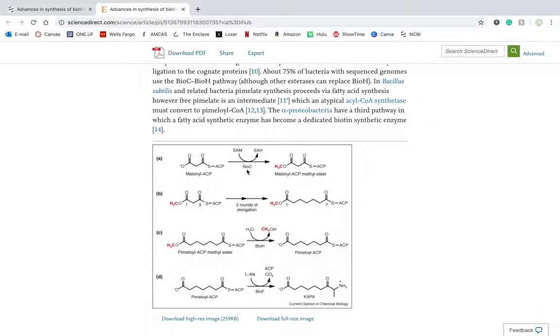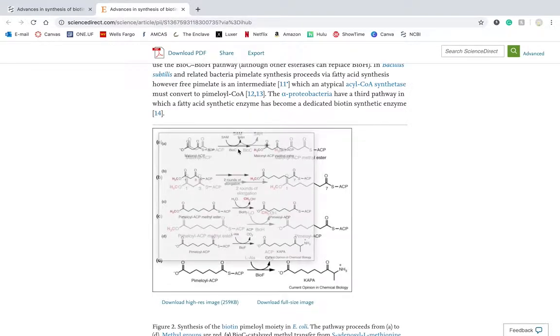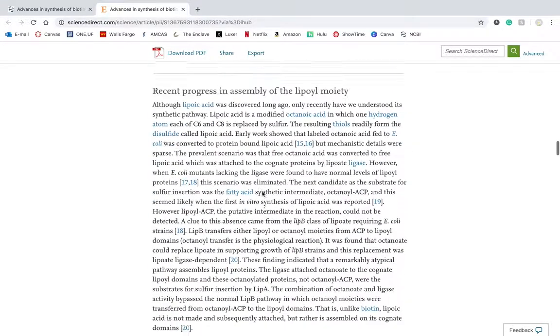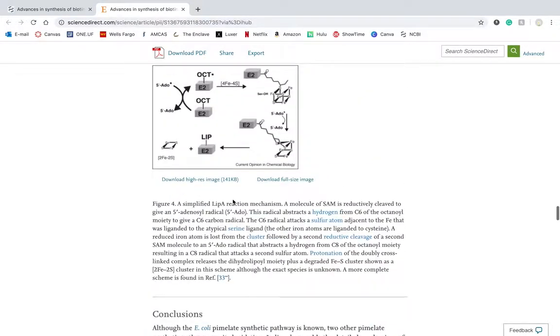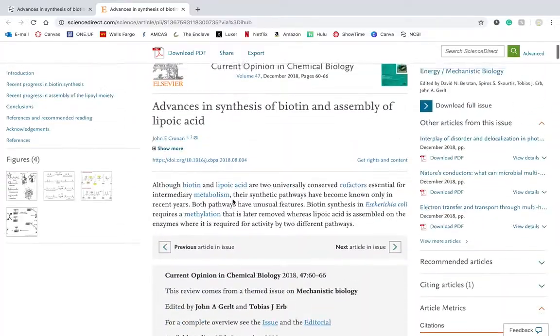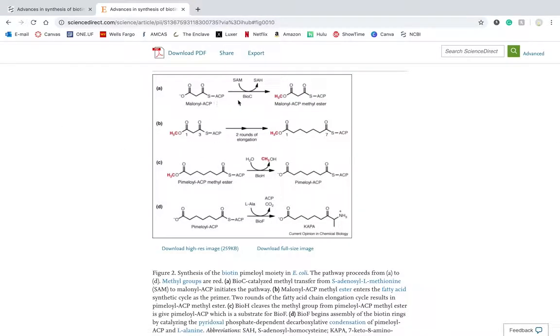And as you can see, these are some of the enzymes or genes that you're going to be wanting to look for. So then you know, okay, this is a part of the pathway. These are some of the things along the way that I need to get the EC number and the sequence for. So again, you can just look through, and at least you're going to get some of the ones you want. BioC, for example. So let's just start there.